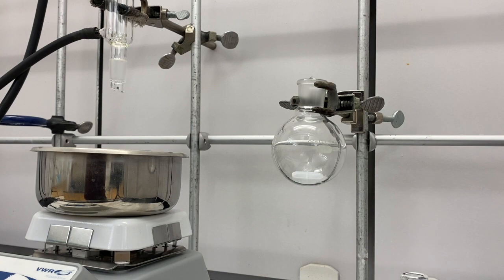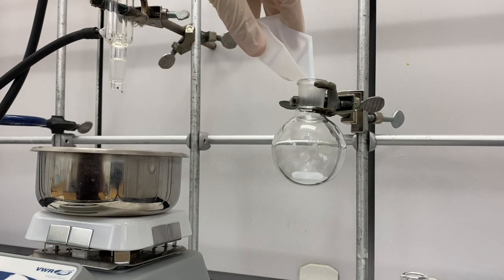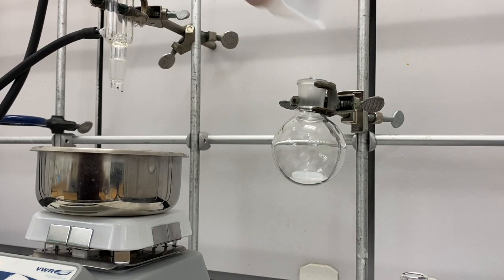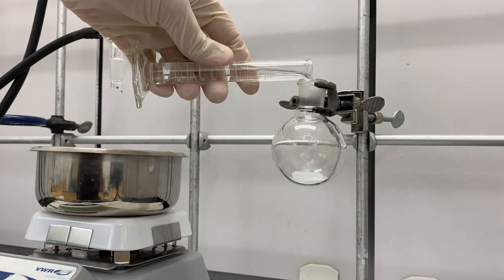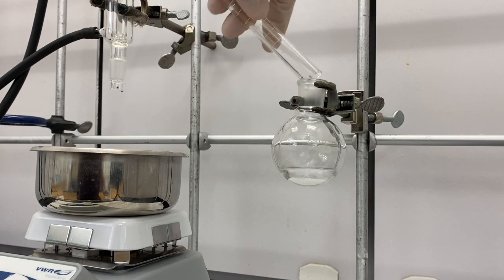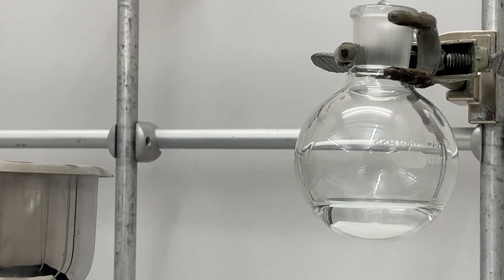I have my 100 mL round-bottom flask with a stir bar in it. I'm going to add my trans-stilbene that I weighed out a second ago, and then I'm going to add 10 mL of ethanol. Hopefully you can see that with the stir bar settled to the bottom.